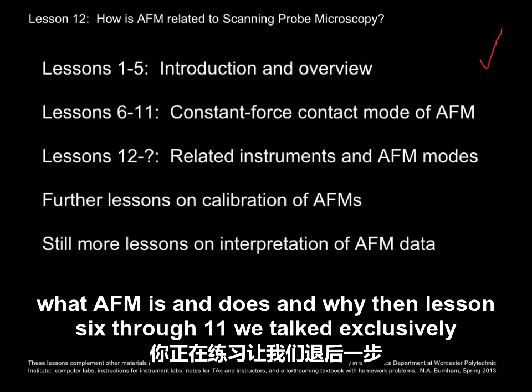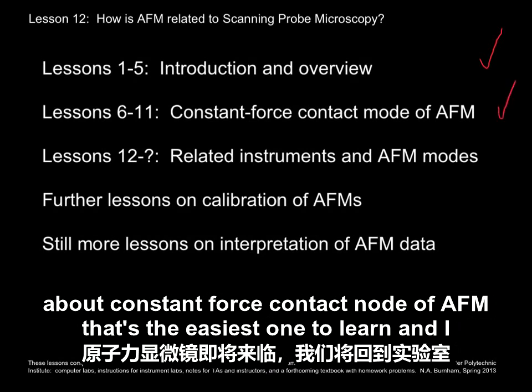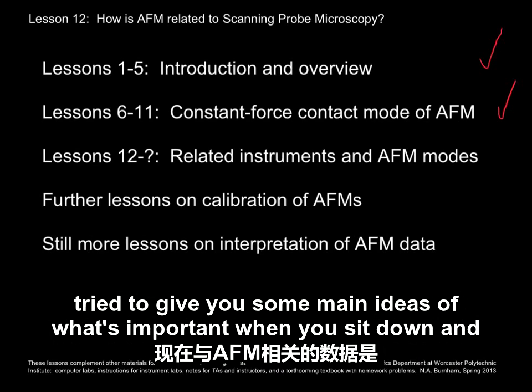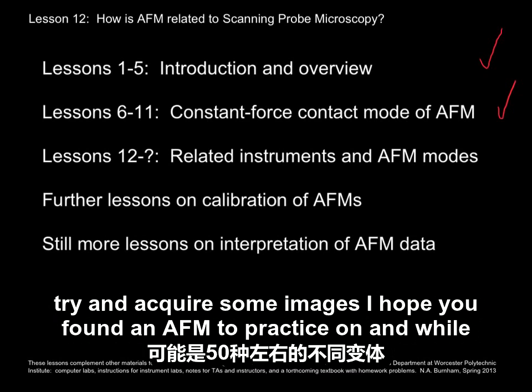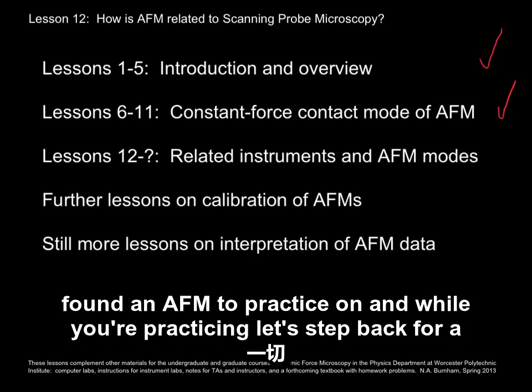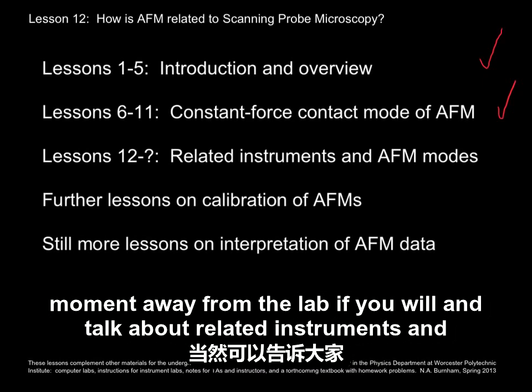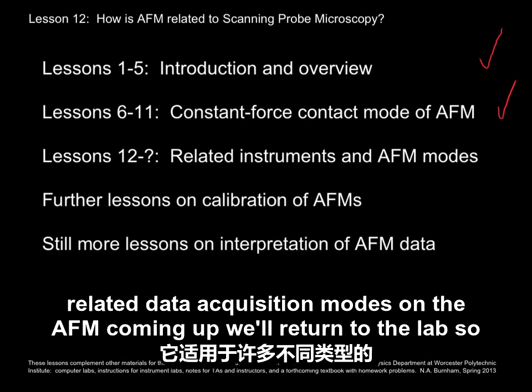Then lessons 6 through 11, we talked exclusively about constant force contact mode of AFM. That's the easiest one to learn, and I tried to give you some main ideas of what's important when you sit down and try and acquire some images. I hope you found an AFM to practice on, and while you're practicing, let's step back for a moment, away from the lab, if you will, and talk about related instruments and related data acquisition modes on the AFM.